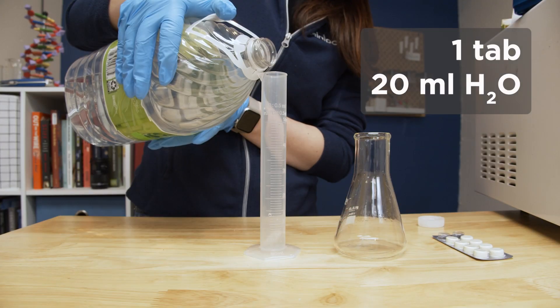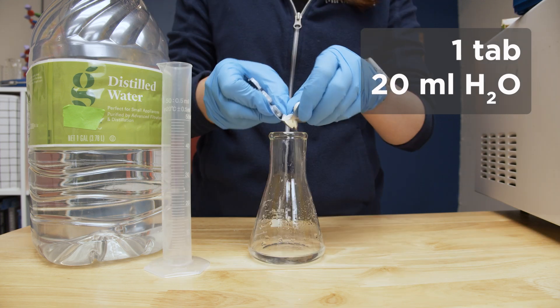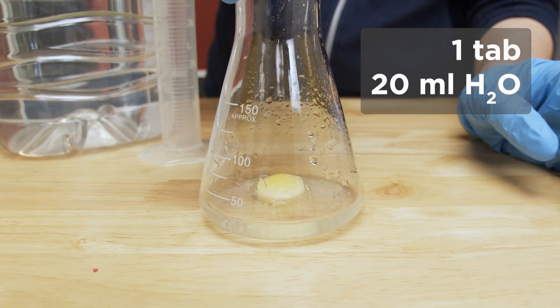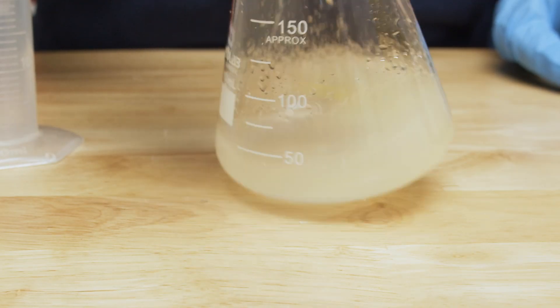To cast a 2% gel, add one all-in-one tab to 20 milliliters of room temperature distilled water in a container with at least 100 milliliters capacity. You can adjust these volumes to cast any desired gel percentage or to prepare multiple gels at once. Let the tab soak until it breaks up, then swirl until it is fully disintegrated.